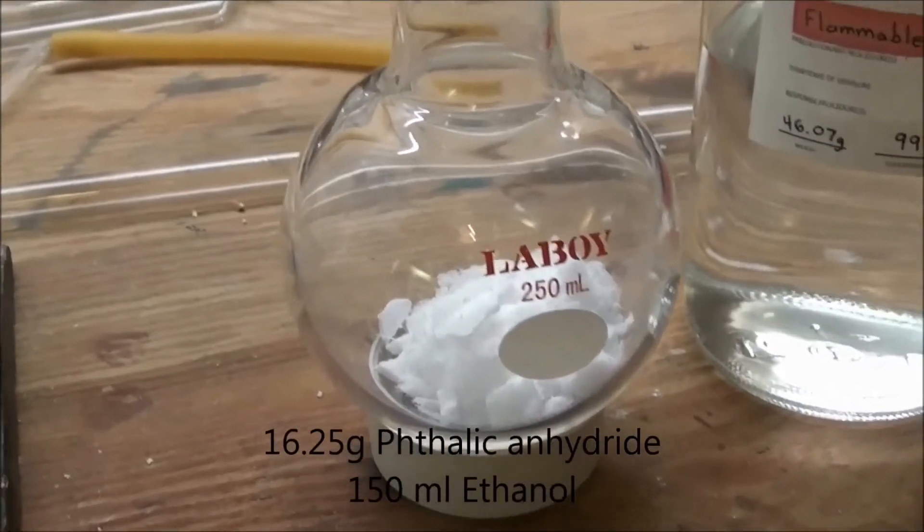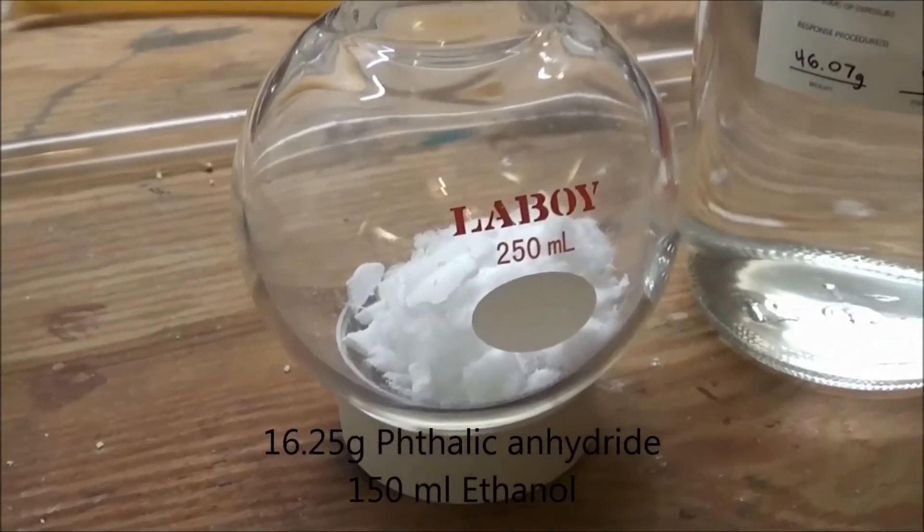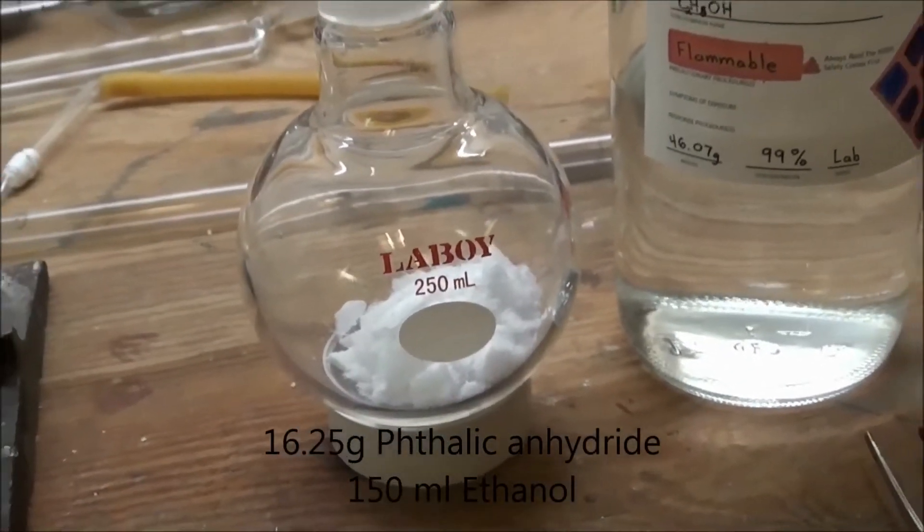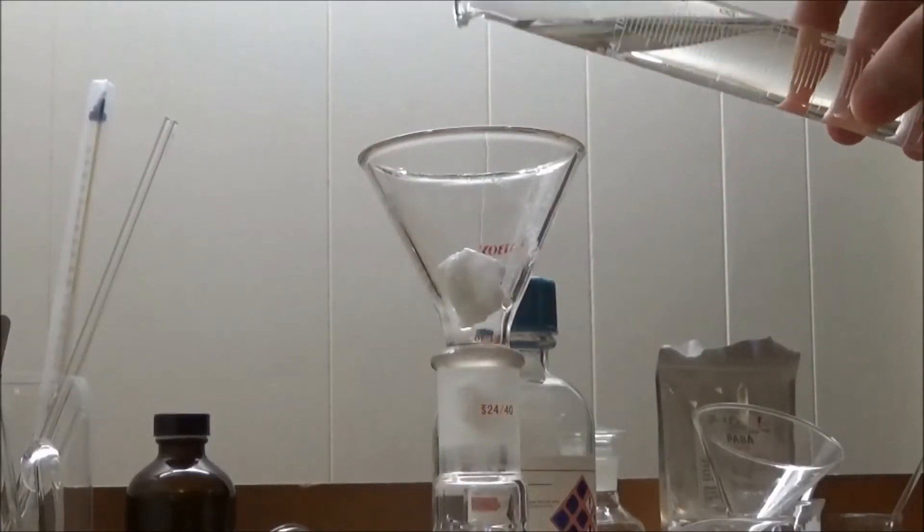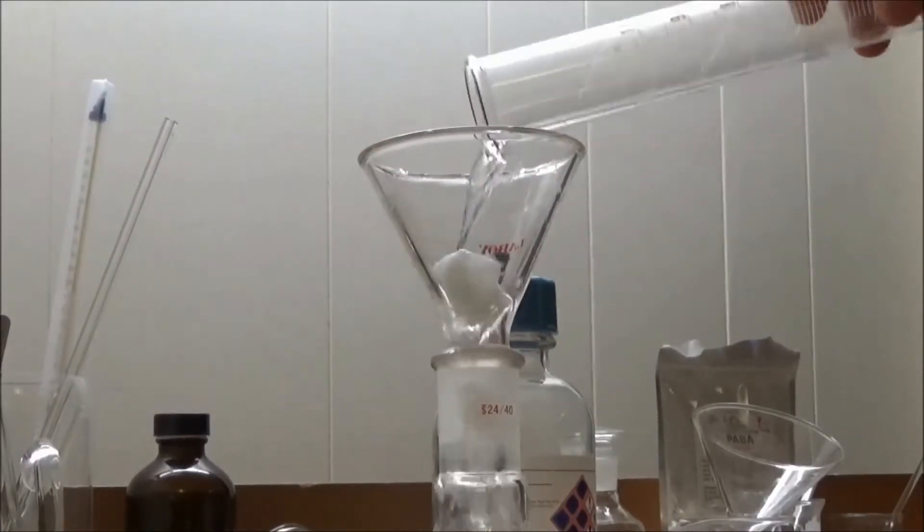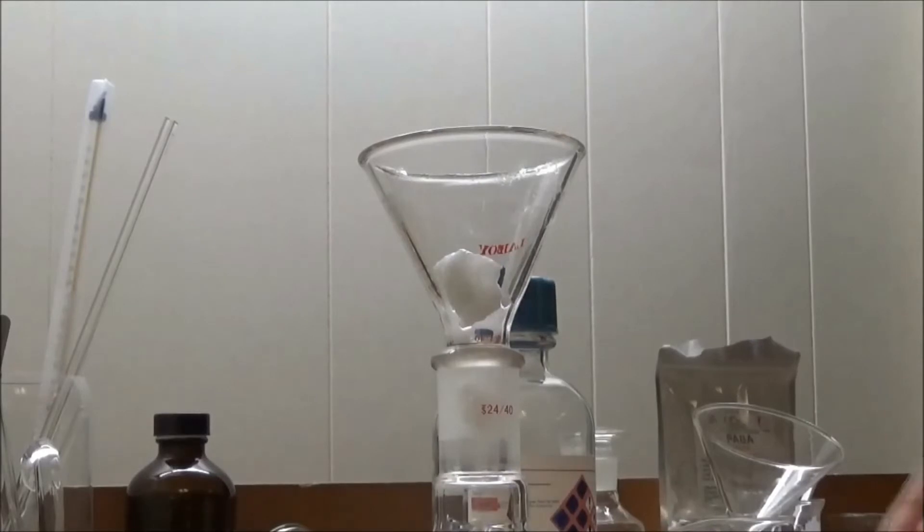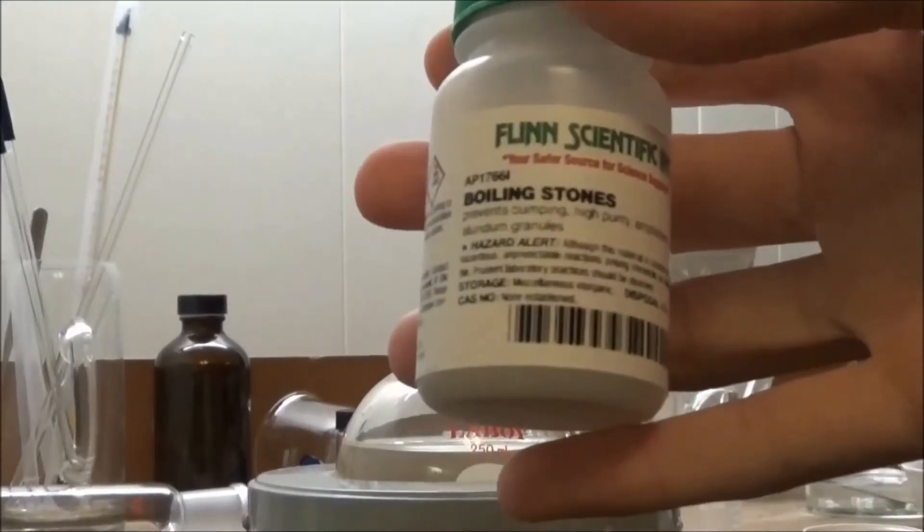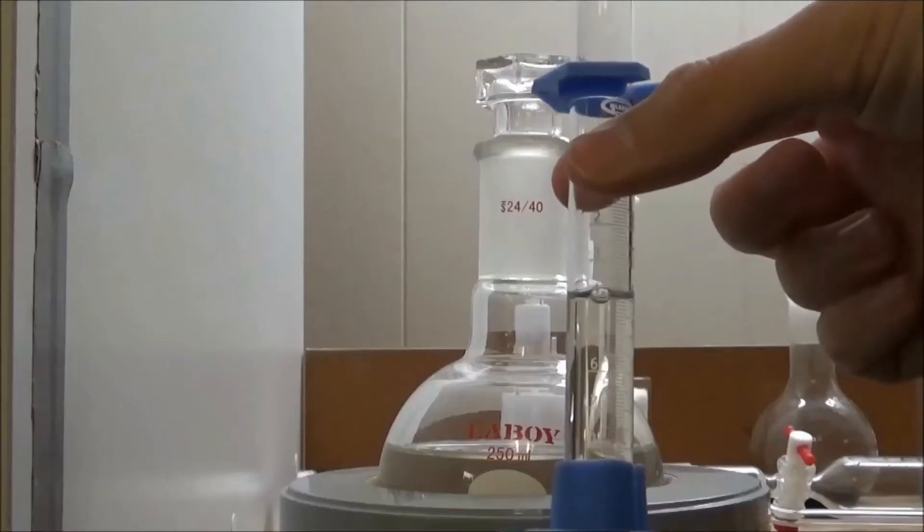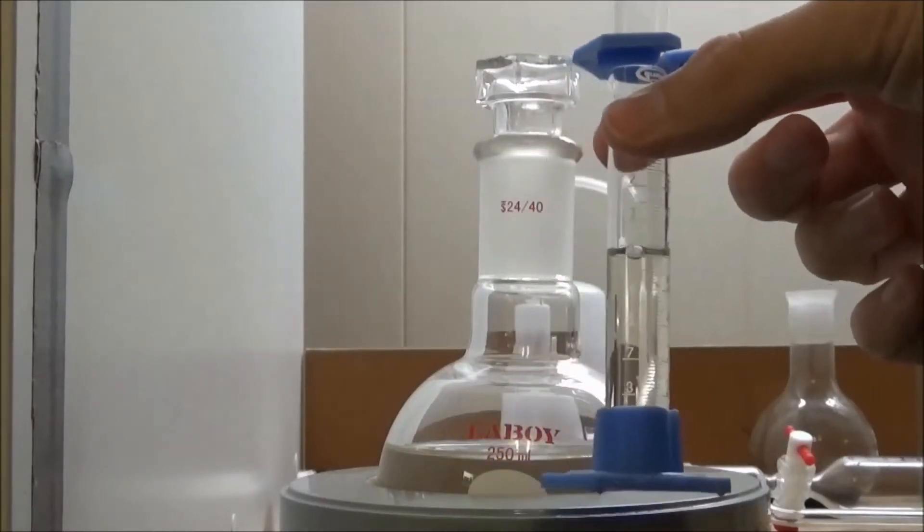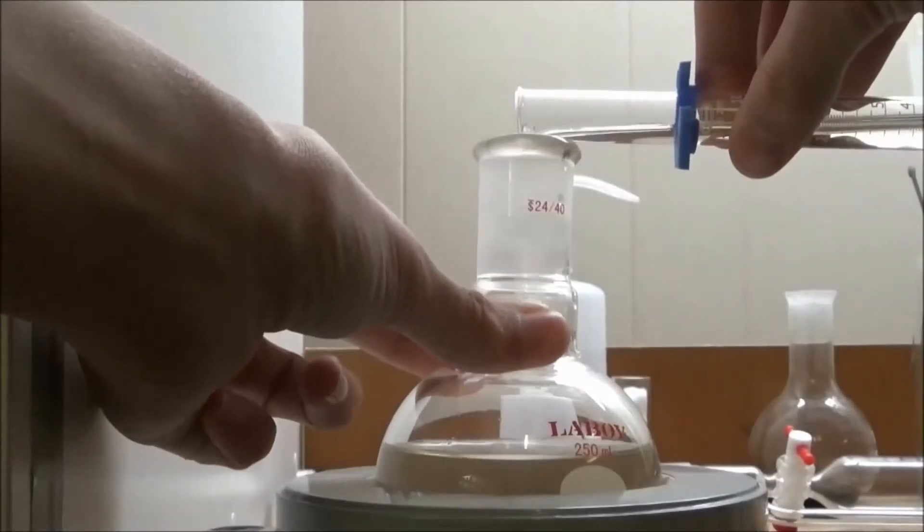First I measured out 16.25 grams of phthalic anhydride and transferred it to a 250 milliliter flask. This was followed by 150 milliliters of ethanol which was used to wash the funnel out. A boiling stone was added—a stir bar would also have been fine. Finally I added six milliliters of concentrated sulfuric acid.